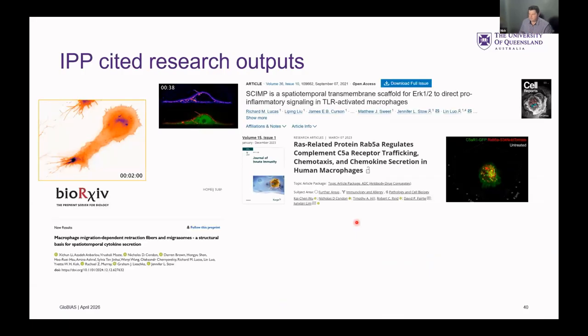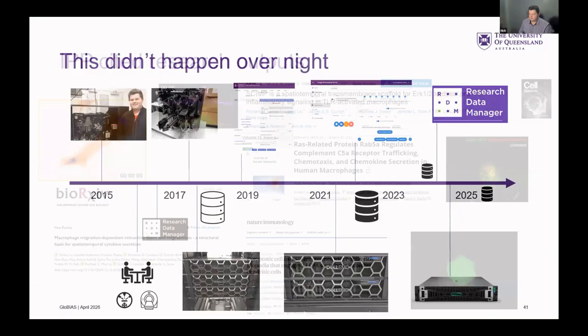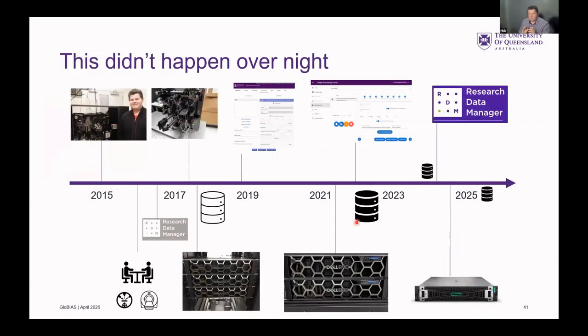And we've got a bunch of our users we've convinced to use and process it. This didn't happen overnight though. Younger, happier Nick went to Janelia back in his PhD, used the lattice. We came back and we bought one a number of years later. In that time, when I came back with a suitcase full of hard drives, we formed the big data problem group. So we had people doing preclinical high resolution PET scanning. We had the serial block face EM and cryo EM coming. So we knew that there was this data avalanche.